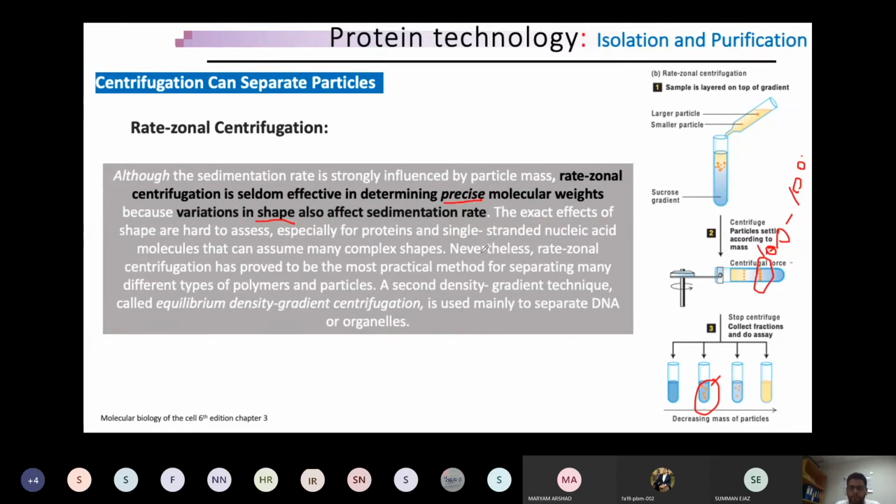So mass is of course a much better approximation than density. So you are right, because हमने भी पिछली स्लाइड्स में देखा कि डेंसिटीज का इतना फर्क नहीं पड़ता प्रोटीन्स के ऊपर जी. Okay, now let's move on to the next.